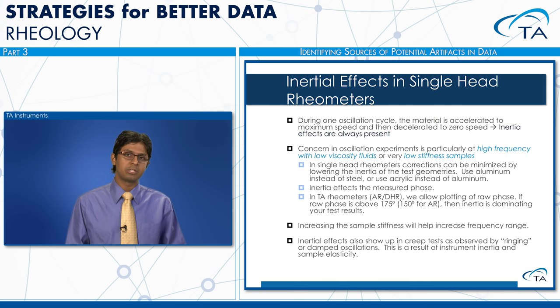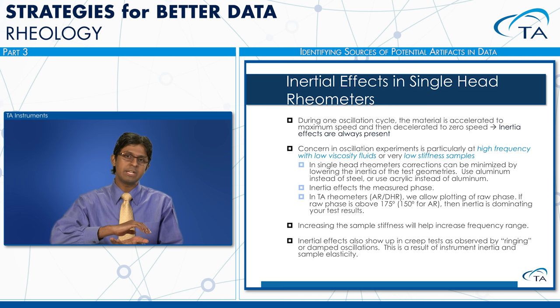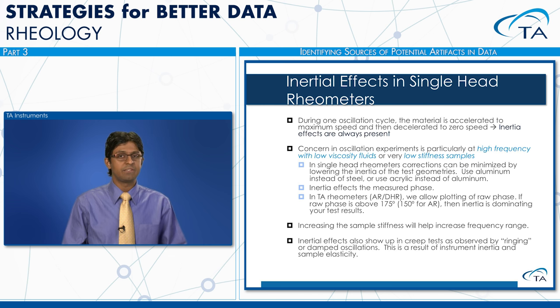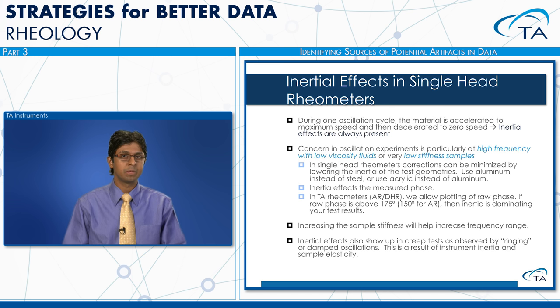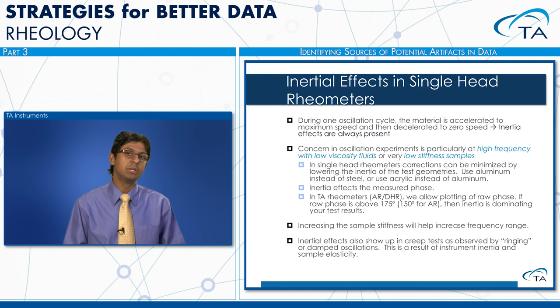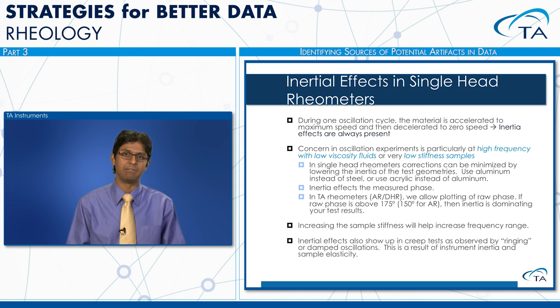In single head rheometers, inertial effects are almost always present when doing oscillation experiments, because during each oscillation cycle we accelerate the material to maximum speed and back down to zero. These effects are particularly pronounced with low viscosity materials at high frequencies or samples with very low stiffnesses. Inertial effects can be minimized by changing the geometry; aluminum is a better choice than stainless steel, and acrylic geometries are better than aluminum because they have lower mass.